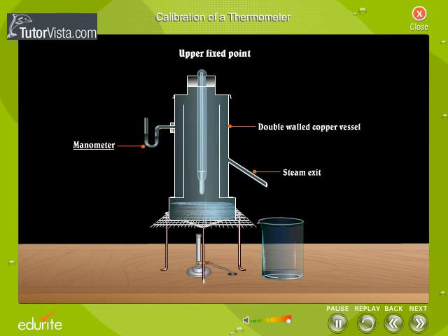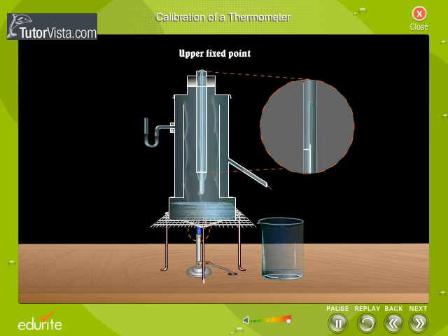The manometer indicates the difference in the pressure inside the chamber and the atmosphere. The thermometer to be calibrated is inserted inside the Hypsometer through the cork at the top such that the bulb of the thermometer remains above the surface of the water in it. The water is boiled and the steam produced passes up through the inner chambers and descends down through the outer section as indicated by the arrows. The bulb is surrounded with pure steam at atmospheric pressure.